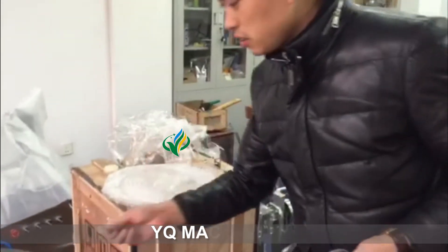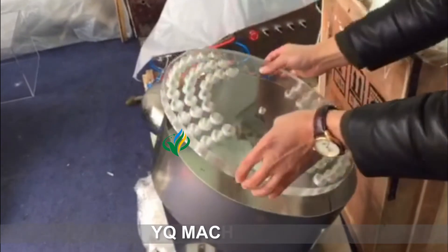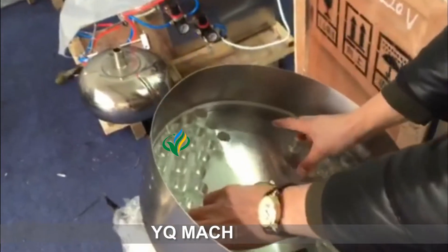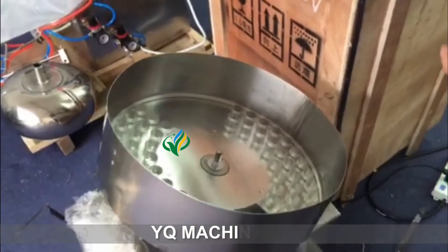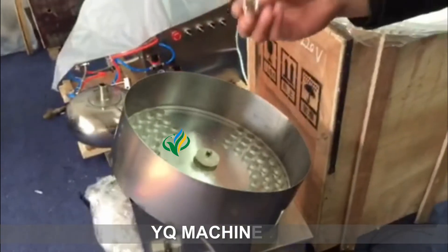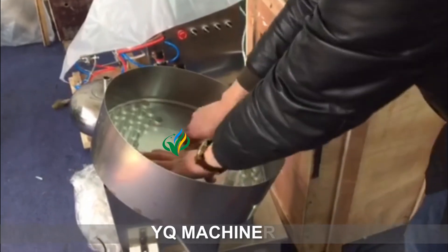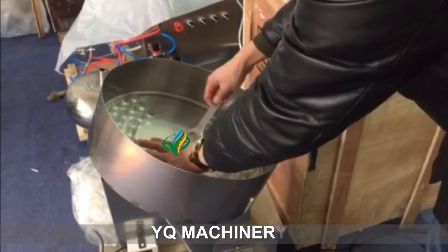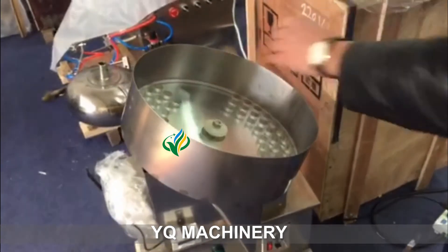First put this one here, then do like this. Because the board is very thin, so just use one is okay, then use the screw lock it. Done.